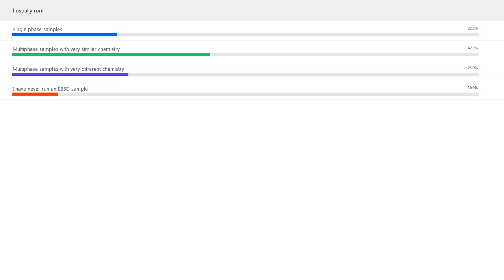Of course, multi-phase samples with very different chemistry, between that and the other multi-phase one, is the target audience for this talk. And of course, those of you out there who've never used EBSD, I hope you use this as a learning experience and realize that there are plenty more webinars out there to teach you what to do, and that's why I do these. So again, that's pretty much what I expect.